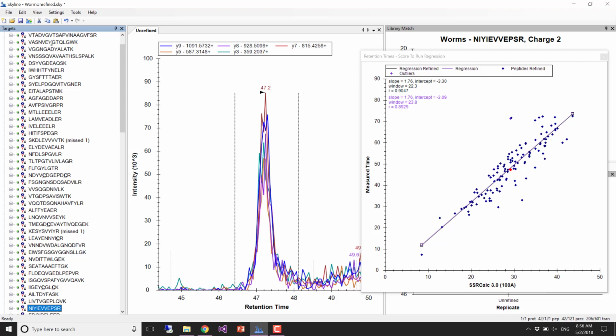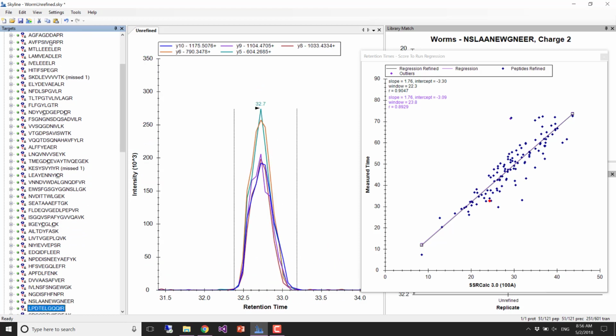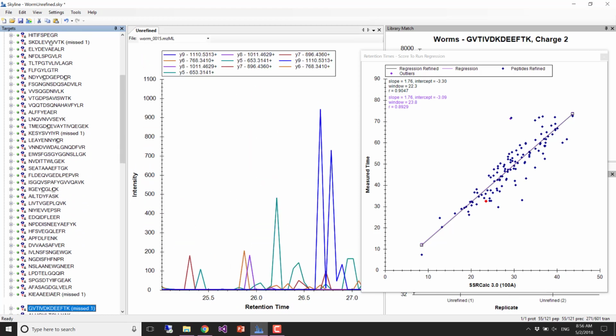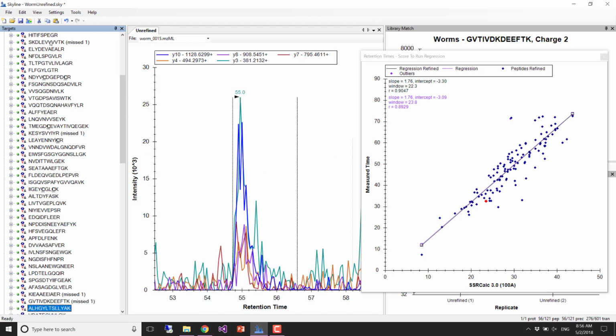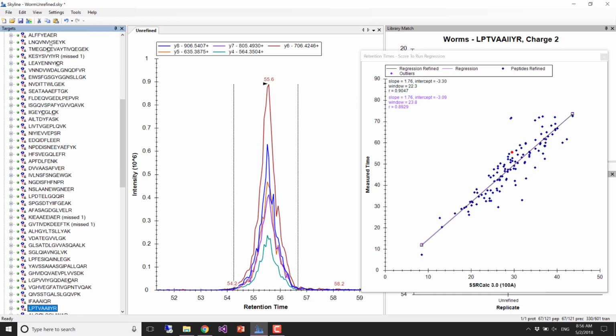So that cut the set of things we are considering in half, but still gave us reasonably nice results. Well, that one, I don't know what's up. Oh, that's not that great. So yeah, there are going to be some things that aren't that great here. So let's go, we have like 5 minutes left.